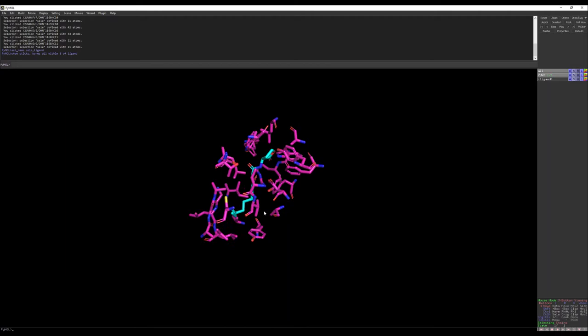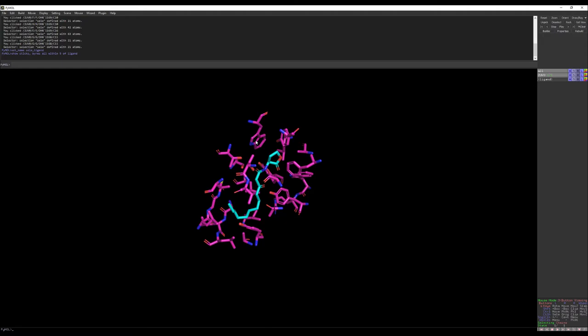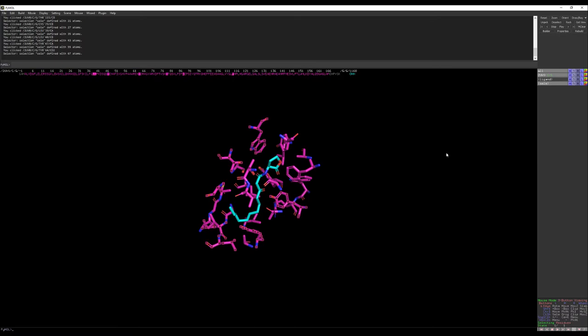You can also change it to 3 Angstroms distance. To get the information of these residues, go to S to see the sequence. When you click on a particular residue, the chain may be selected by default, so change the selection level to residue. Then when you click on residues in the 3D view, they get highlighted in the sequence, and you can see the number and name of each residue.